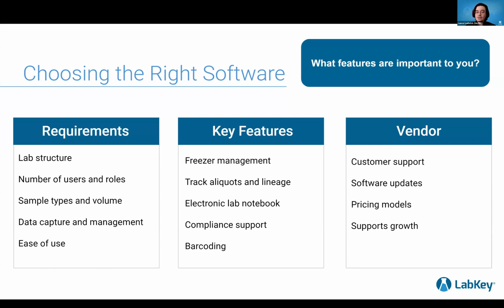But then ultimately, do you like working with that vendor? Can you see yourself growing with them or getting the support from them that you need? Do you click well with them? Having a better understanding of what's important to you and what your needs are can make sure that you're more successful in picking the right software. So keep all of that in mind today as we look at Sample Manager.